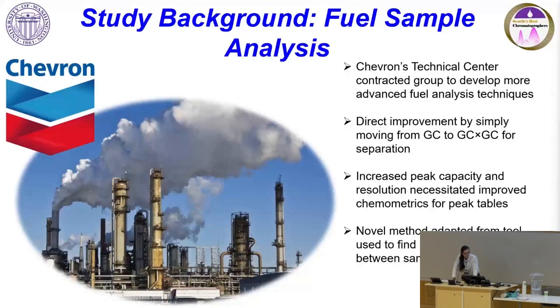And from that, the straightforward part was just developing a relatively straightforward GC×GC method. But from that, you have so many more peaks that it really emphasizes the need for a chemometric method to get that comprehensive peak table. And that's the bulk of this talk and the method that we forwarded and recently published on how to do that.